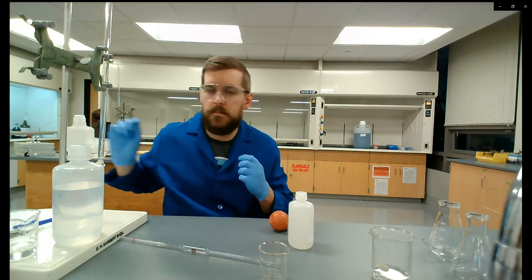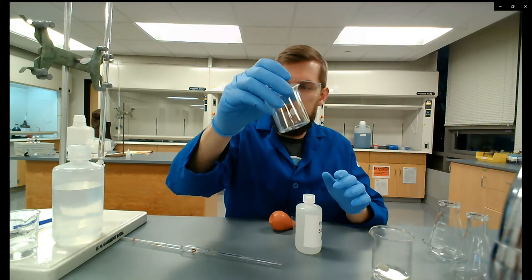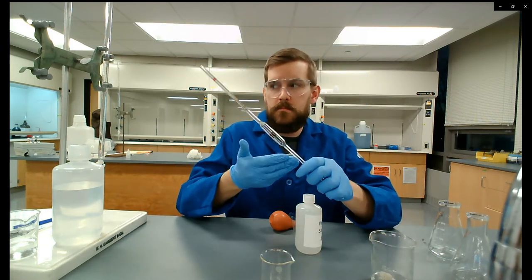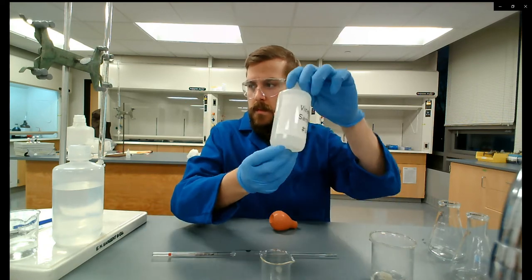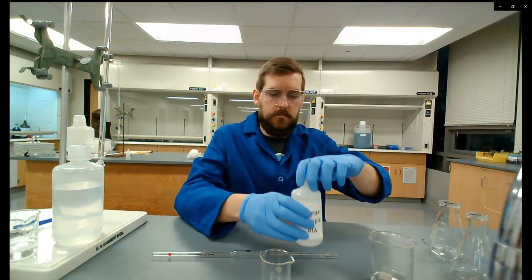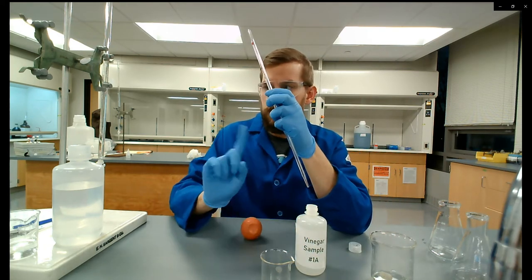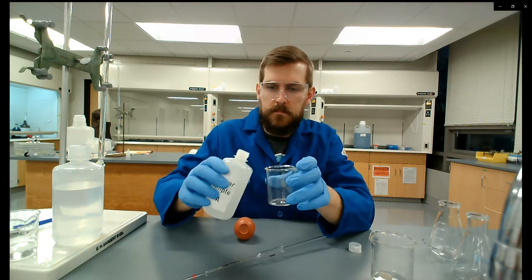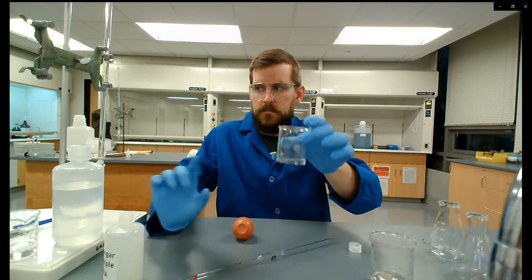We're going to do the second set of titrations. I have my vinegar sample, a clean dry beaker, and a beaker for waste. Grab your volumetric pipette and pour out some vinegar sample. I'm about to make a rookie mistake — don't ever pipette out of your vinegar sample directly. If your pipette is contaminated with anything, you introduce that to your entire sample, which is bad.